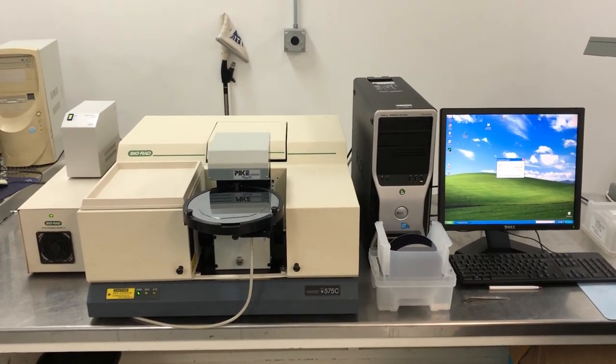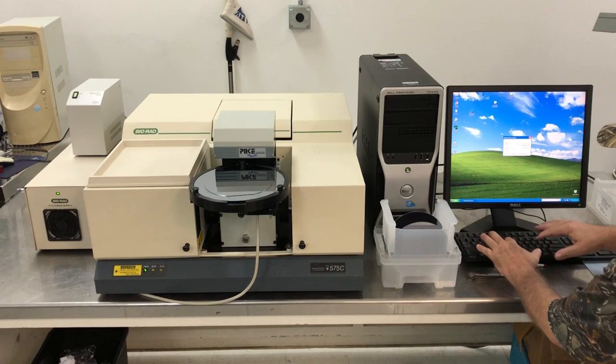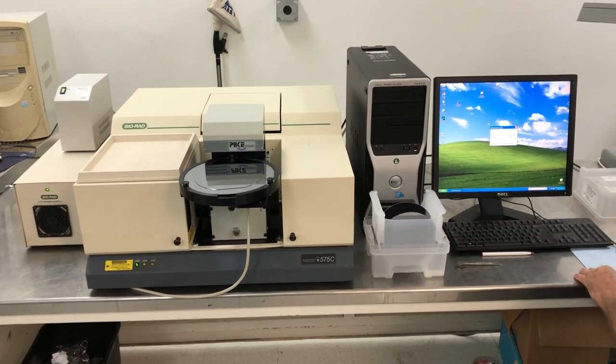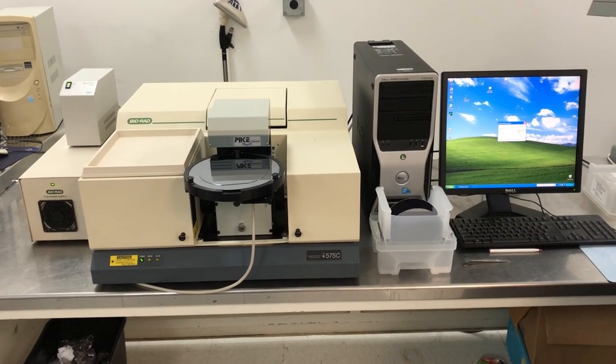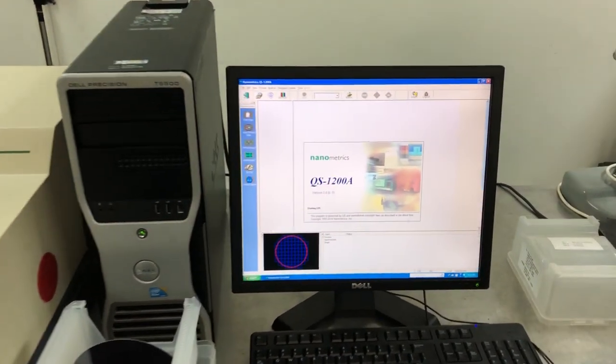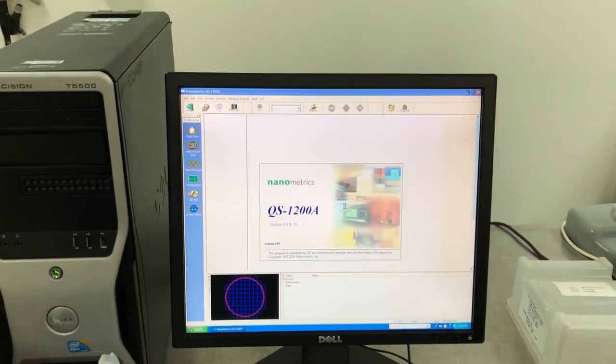Hello folks at Fraunhofer. This is Greg Wright. I'm showing you your QS1200. It's booted to Windows and we're just logging in. Here's the software. We're going to run a pair of Epi wafers.